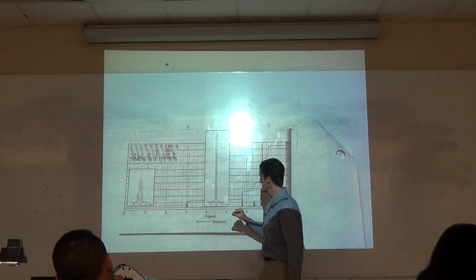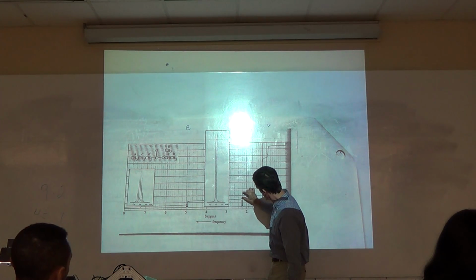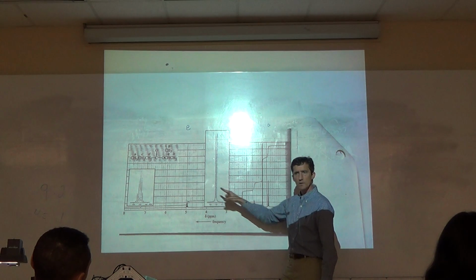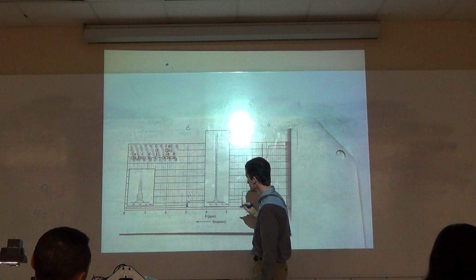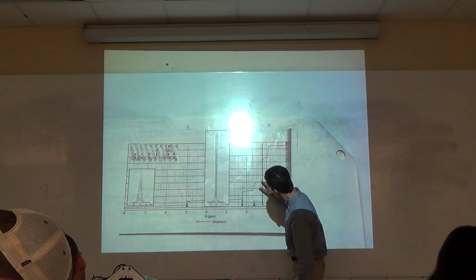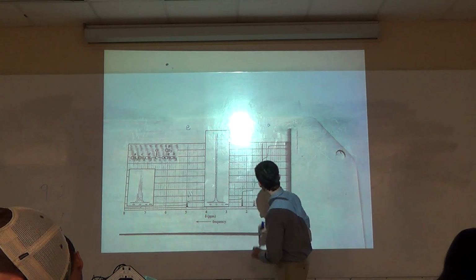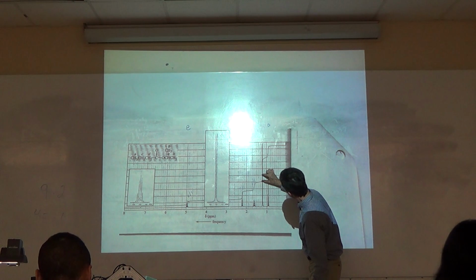1, or we could get to that. So if that's 1, how many is this? 2. It looks like it's twice as long as that. I want to say that's 1H, and I'm going to say this is 2H. If that's 2H, how many is that? It looks the same. I'm going to say that's 2H. If that's 2H, how many is this? 6.